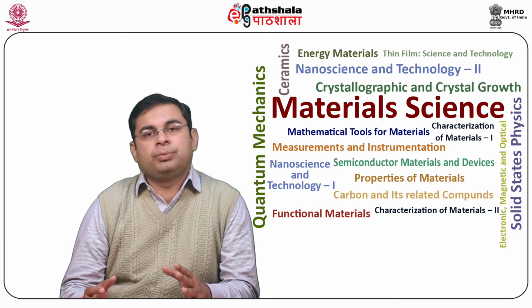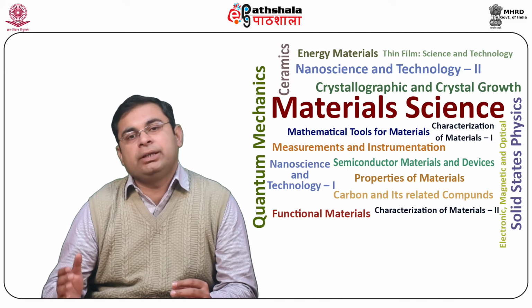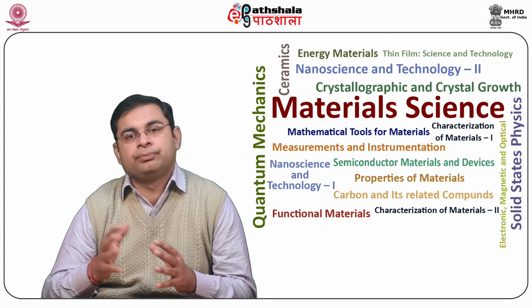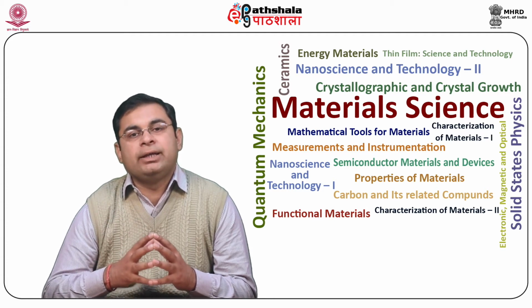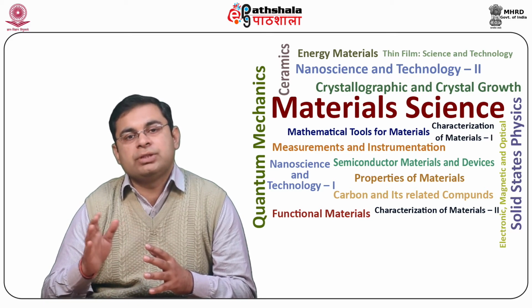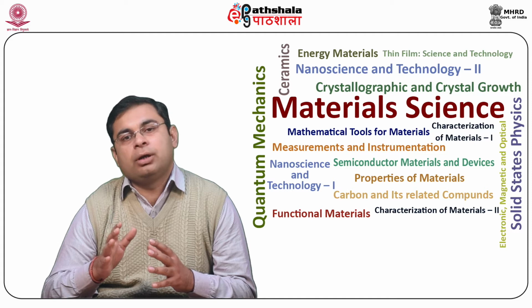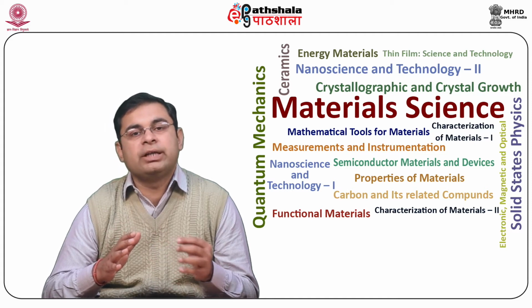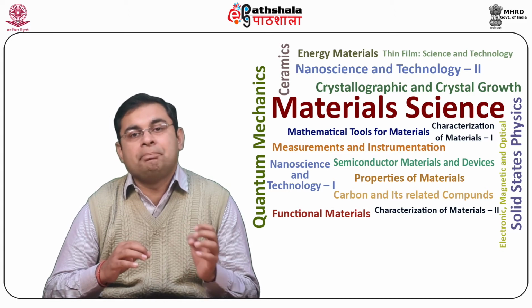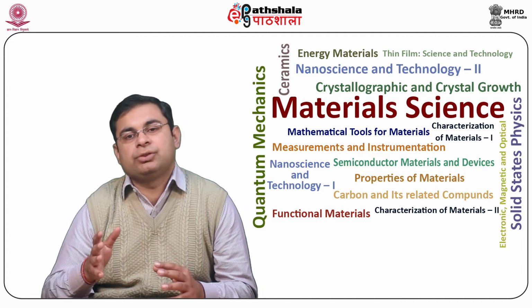Auger electron spectroscopy, that is AES, is a non-destructive electron spectroscopy technique for partial identification of elemental composition of materials. Samples can include surface, thin film, interface, etc. High surface sensitivity, that is analysis depth less than 100 angstrom, and a relatively low detection limit, that is around 0.1 atomic percent, makes AES a very popular technique for surface analysis.